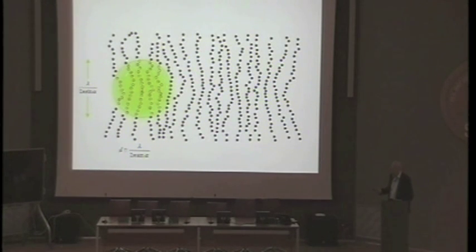And one solution to the problem is the following. If you think about the problem, what is the problem? Why can't we separate this from that and this from that? One way of saying it is we cannot concentrate the light, the illumination light, any further than this blob, as I explained. The lens produces a spot of light, as we learned at school, and you cannot make it smaller than this value, than this distance, this spot of light. And because of that, all the features that fall within that region will be illuminated at the same time.